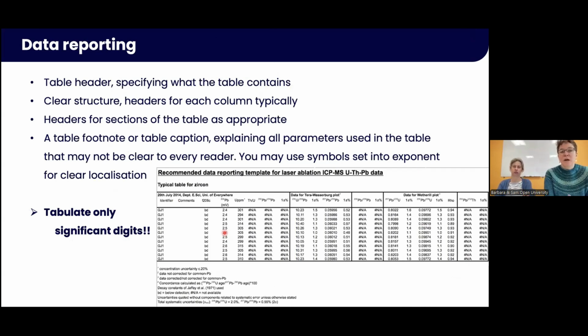And that is also important then for data reporting. This is not just important for a publication, but also important throughout your working with your data, that you have very clear structured tables that have a header which they contain, and that you know which column it is, because I have to admit that I have spreadsheets where I have done some quick calculations and I have no idea what column H is anymore because I have not written down what it is. And that's really frustrating because you have to redo things, or you lose information.